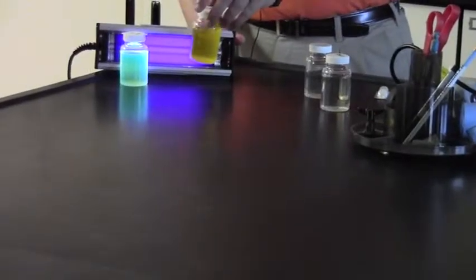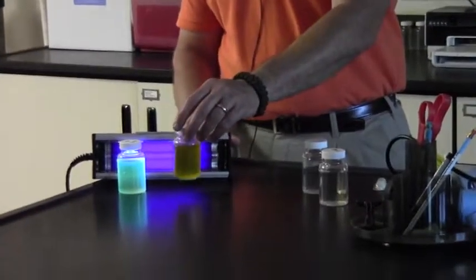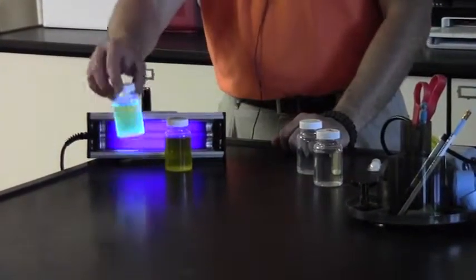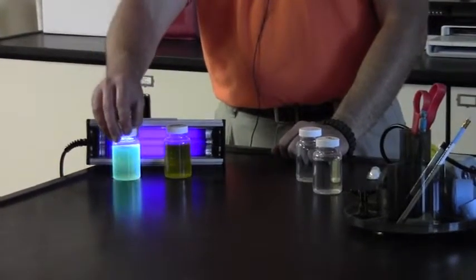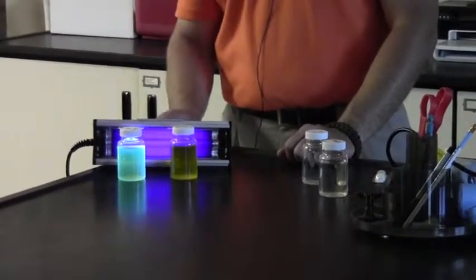We know this one is tolicoliform, which is a presence of bacteria in the water. We know this one is fecal because it is fluorescing with the light, the UV light.